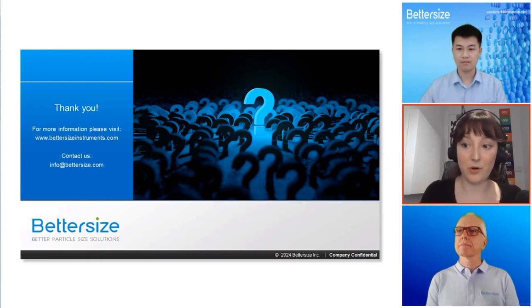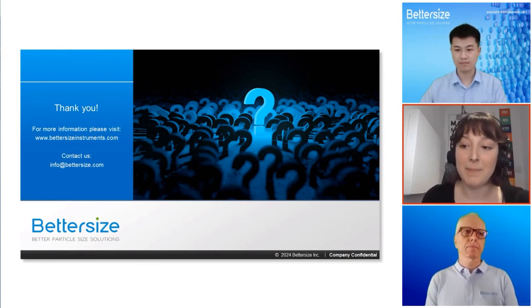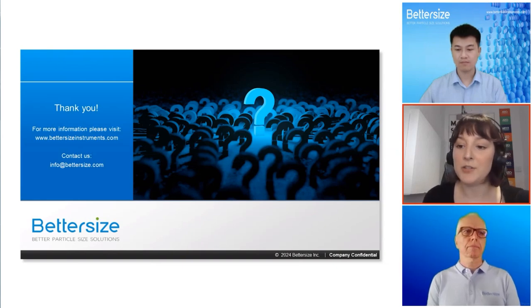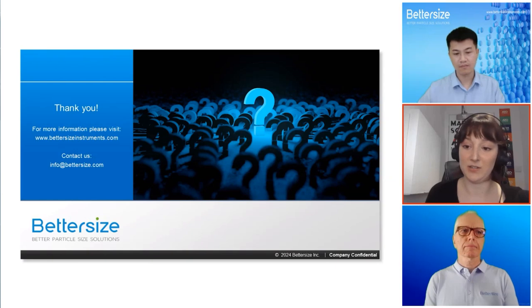Thank you for posting your questions. John, if I start with you first, you explained that dynamic light scattering measures the Brownian motion of particles. Could you describe some of the challenges or limitations of DLS when dealing with highly polydispersed samples or complex formulations?